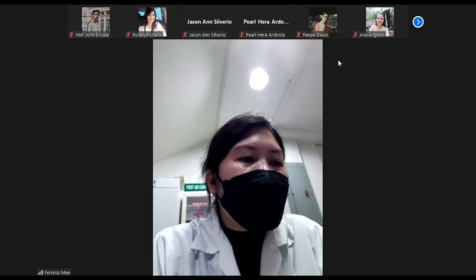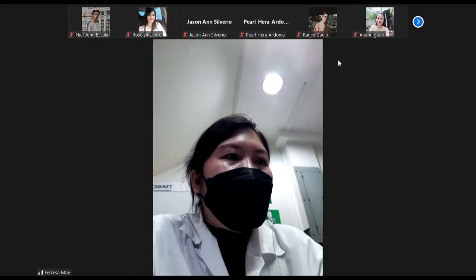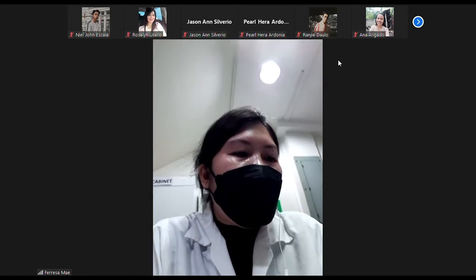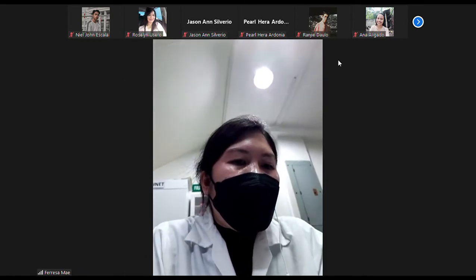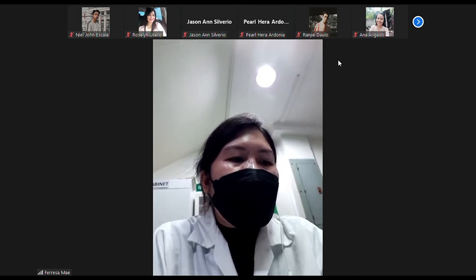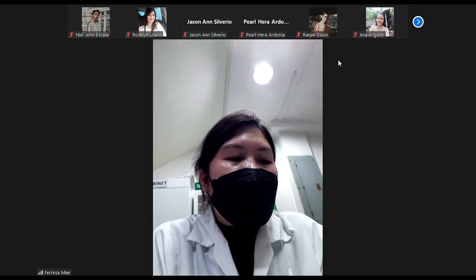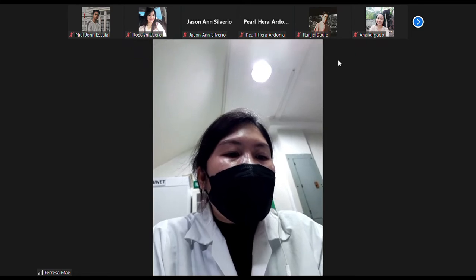And the last one is the water is in a bound form in combination with various substances such as water of hydration. There are many methods of determining moisture in food, but the most widely used is the drying method, in which the samples are heated under specified temperature and the loss of weight is taken as a measure of the moisture content of the sample.